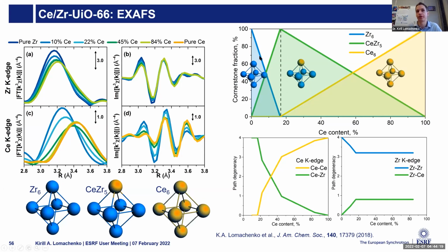So it would be the pure zirconium, with some small contribution of cerium-zirconium scattering.